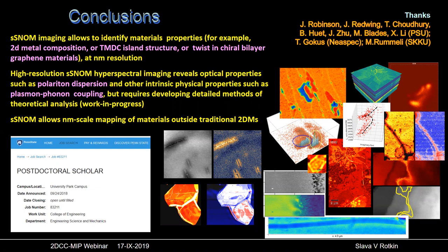Yes, of course, you have to focus them to the same spot, but this is actually relatively painless. I mentioned that our machine has two laser sources, but in a sense, it's not two. It's actually four chips for the mid-infrared laser and six channels for the visible laser. Focusing the different chips and different lasers on the same tip is not only possible, it's relatively straightforward. You need to focus them on the same mirror, but after that, other engineering details have been worked out.